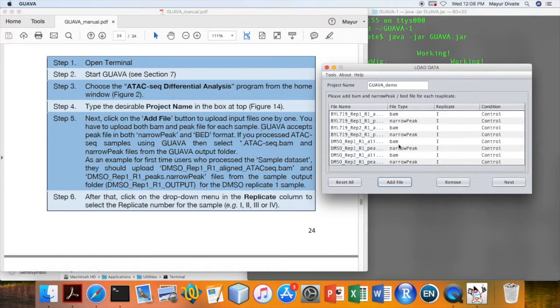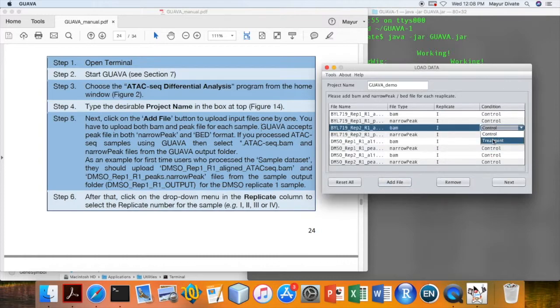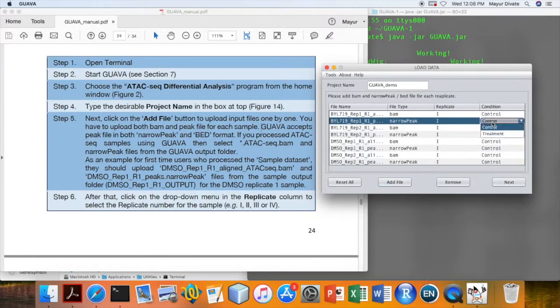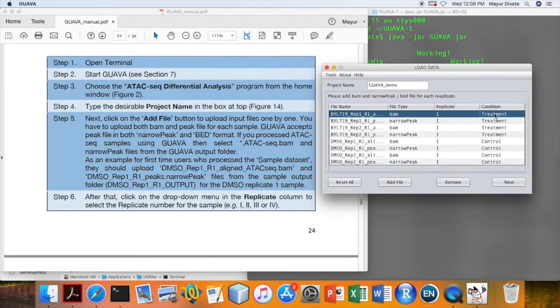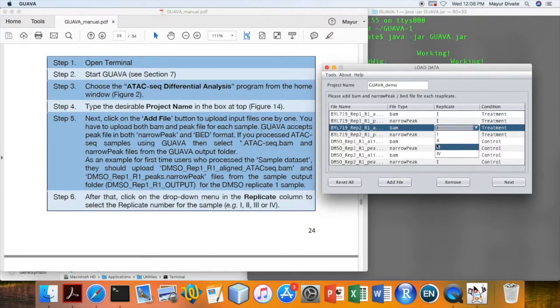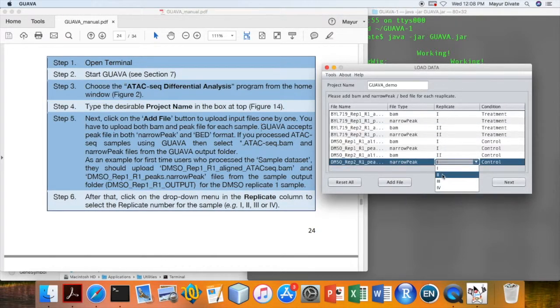Next, using the condition column, divide files into two groups: control and treatment. And after that, use the replicate column to assign replicate number to each file.